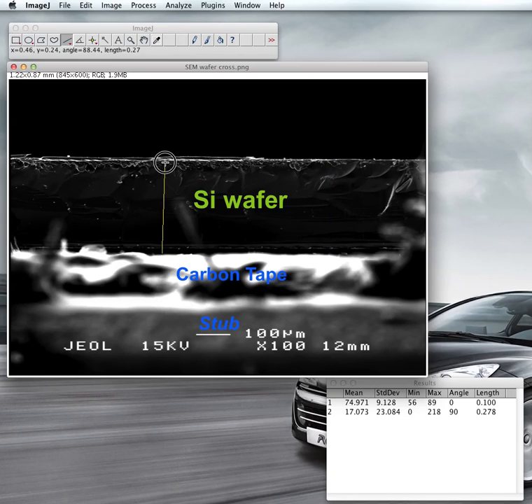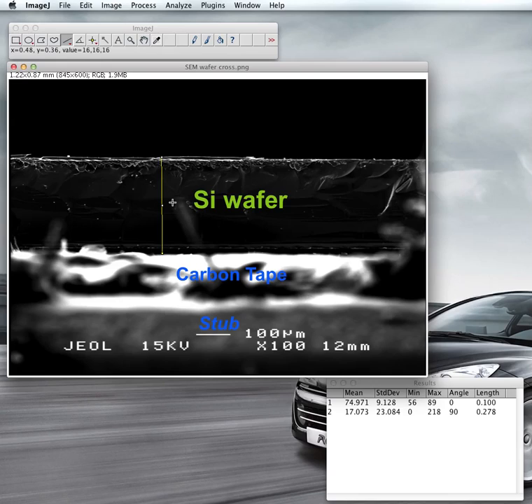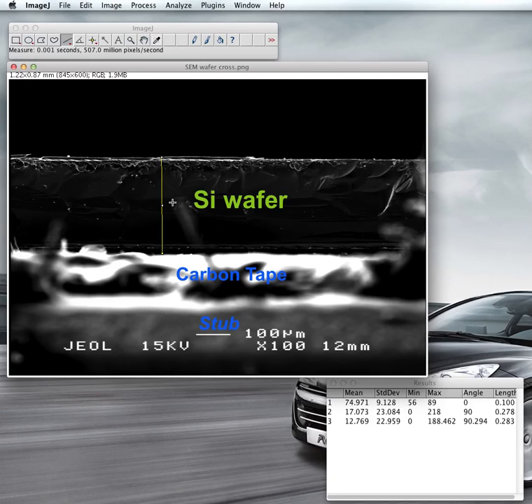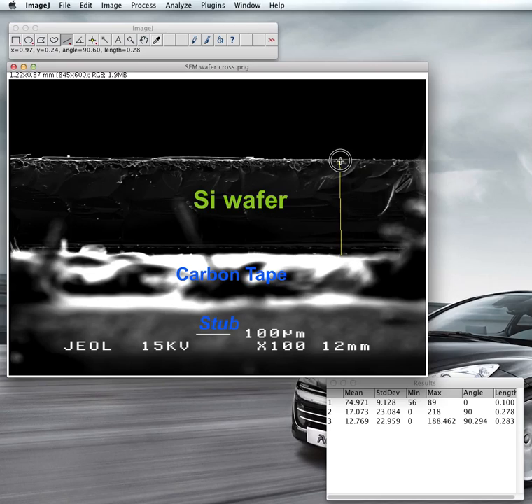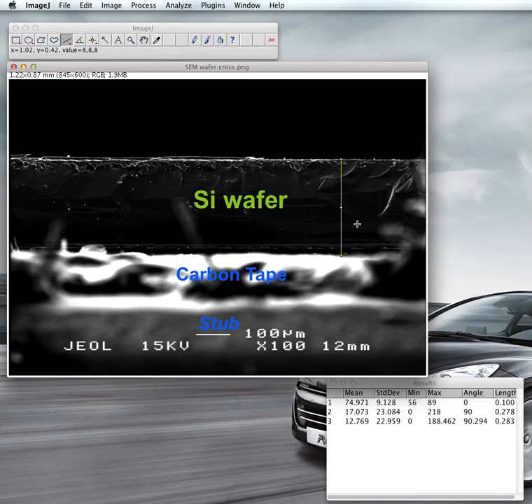You may want to try to do it more accurately, or zoom into the screen. I'll press Control+M again — getting 0.283 mm. You can take a few tens of measurements this way — Control+M — getting 0.283, 0.283, and so on.